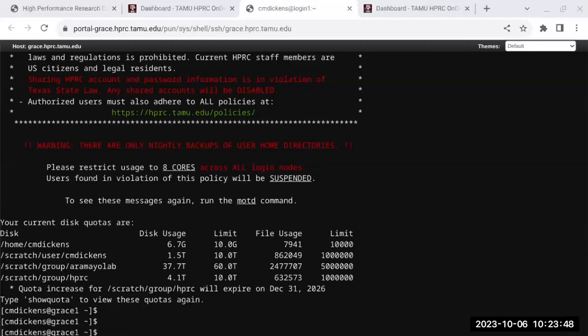You can get 5,000 bases in a row, which is different than the 5,000 base pair mate pair. So you got actually a long read of 5,000 or more bases. It does have a higher error rate, but there are ways to correct and improve the error rate.